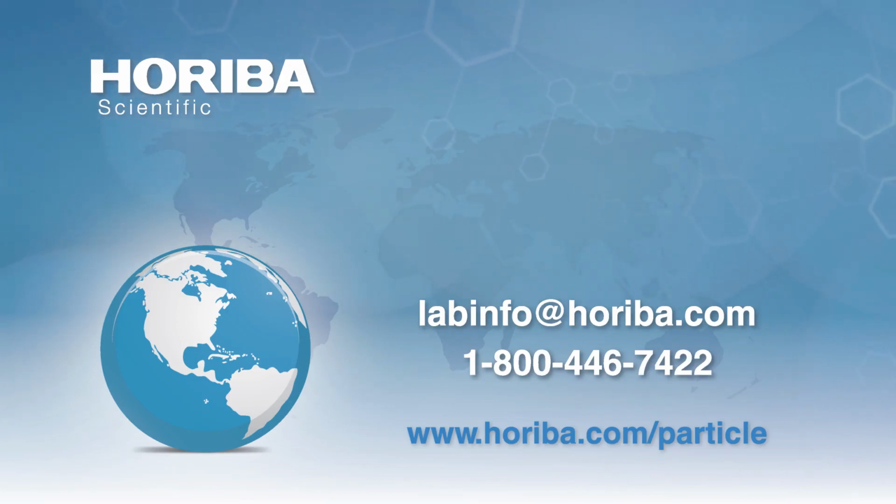Thank you. Okay, next question. What role does PDI play in particle size analysis using DLS? That can play a large role in it. To be honest with you, it's not an area that we have a whole lot of experience working with. So typically, our normal response would be: send us some samples. Typically, we would like to see some good, some bad, and some intermediate samples. Let us show you if we can come up with some data that correlates with what you want to measure.